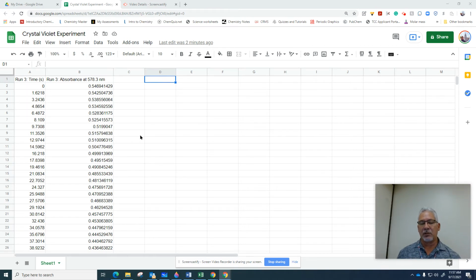Actually, what I'm doing is using Google Sheets rather than Excel. Why? Because it will be easier and faster to do any calculation. So what I did was collect some of the data that I had. I ran the experiment 3 times at room temperature. And the same thing that you will see at room temperature, you have to repeat at cold temperature.